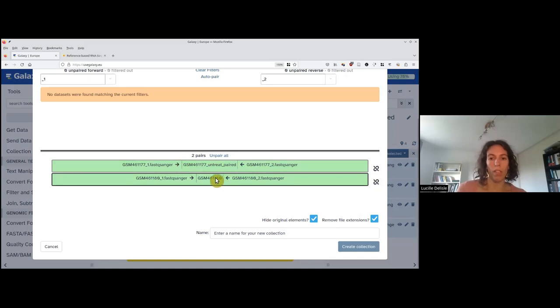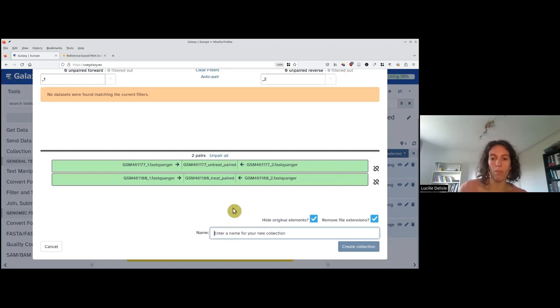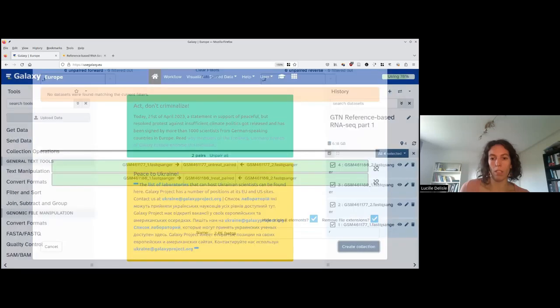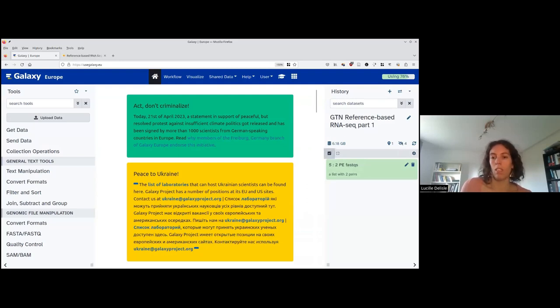Once you have renamed your datasets, give a name to this collection — you can think of the collection as a directory. We will call it 'two paired FASTQs'. Once done, click 'Create collection'. Now instead of having four datasets, we have a single dataset that is in fact a list with two pairs. To leave the checkbox mode, just re-click on the checkbox. You can see on the right that you now have one active dataset which is your list of pairs, and then four hidden datasets.